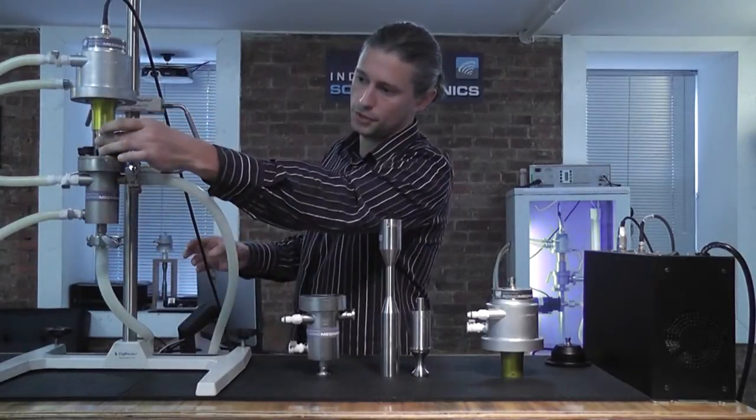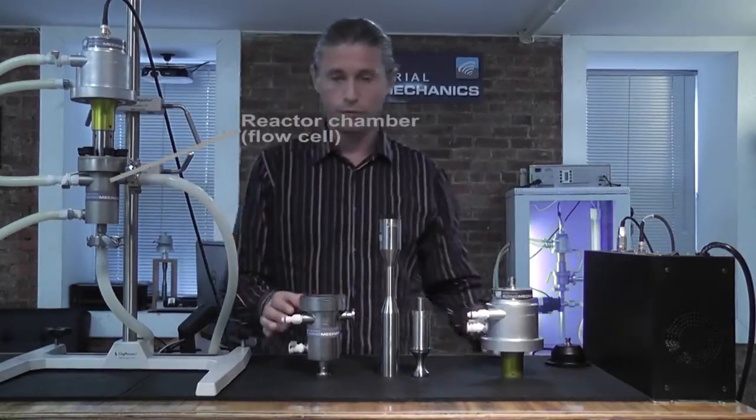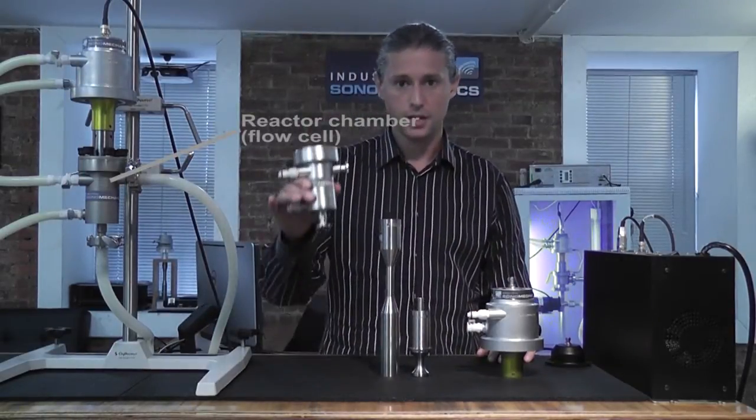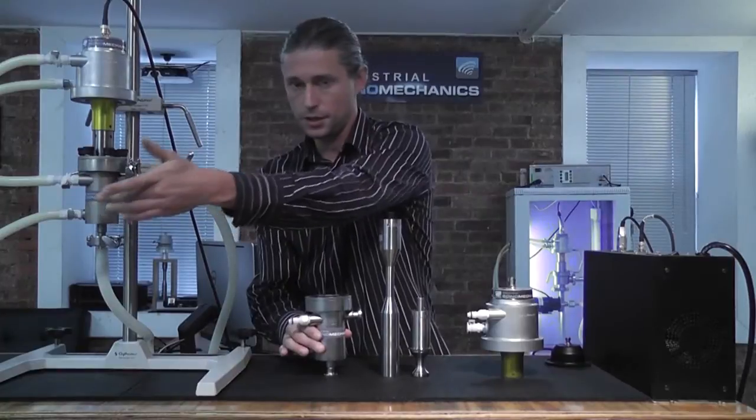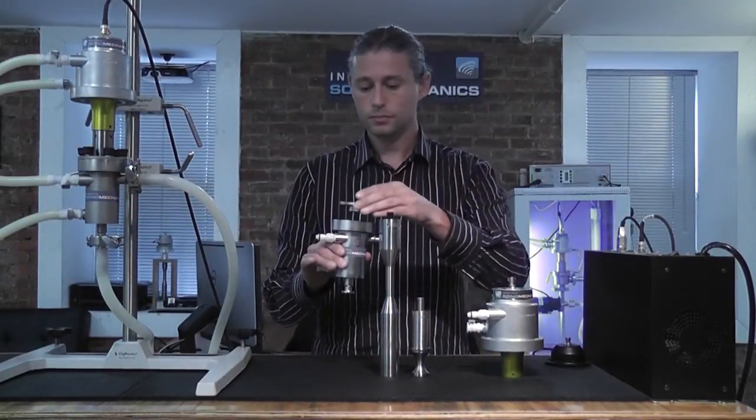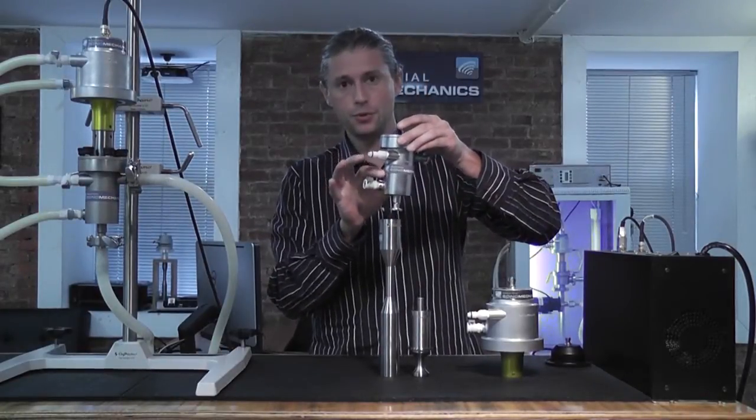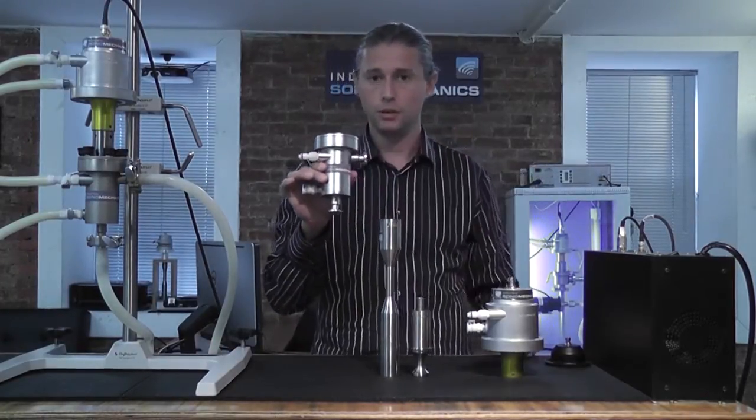This is the part of the assembly which you cannot see because it's inserted in the next fourth component, which is the reactor chamber. You have this here in the assembly, which has a lid, and it also has a cooling jacket, which allows you to control the temperature of the liquid being processed.